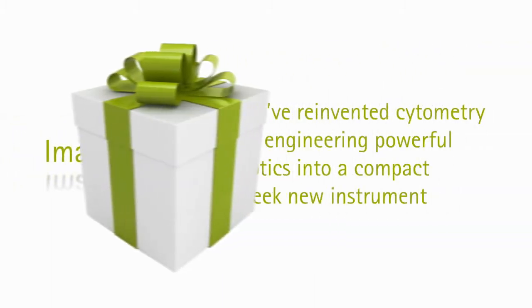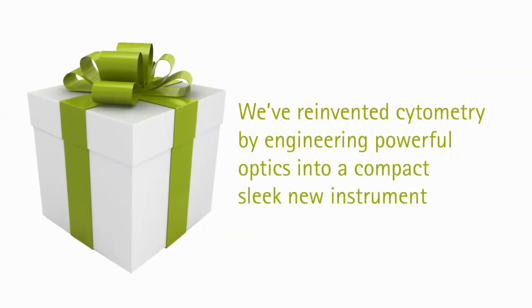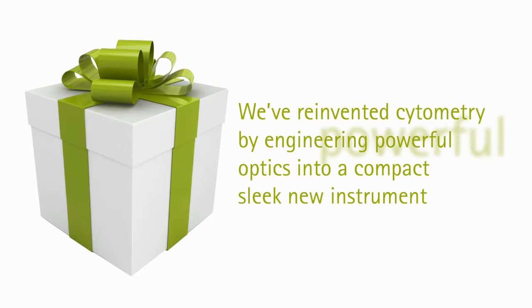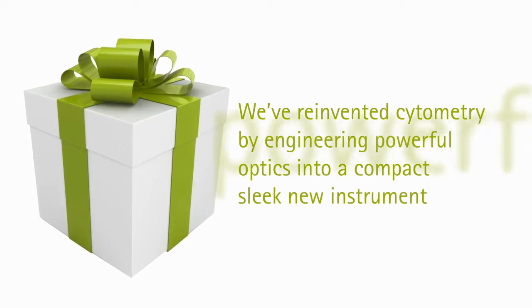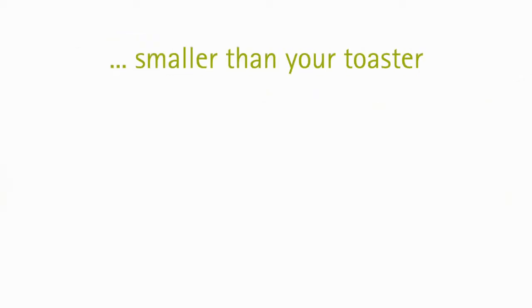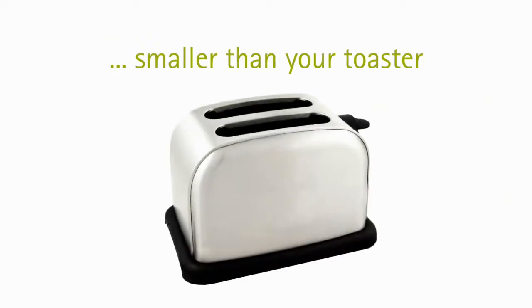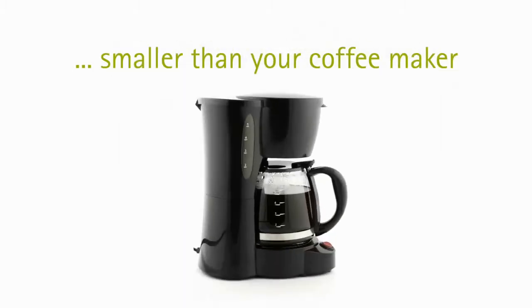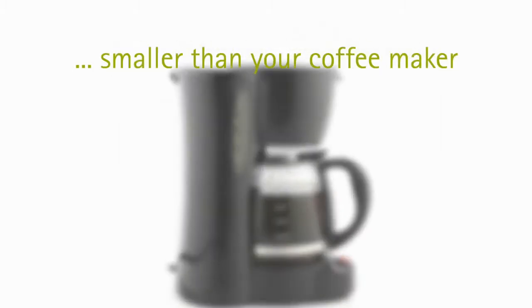We've reinvented cytometry by engineering powerful optics into a compact, sleek new instrument—smaller than your toaster, smaller than your coffee maker.